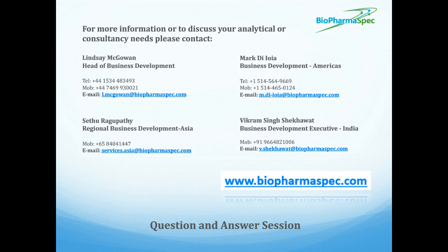So in our opinion, MS is used as an orthogonal approach, i.e. to be done in tandem with the HCP ELISA screening. So in order to provide the broadest degree of coverage of HCPs within a product, we'd recommend using both methods, and that way you get the best knowledge of your product. But ultimately, advice from the regulators should also be sought when making those decisions, I would say.